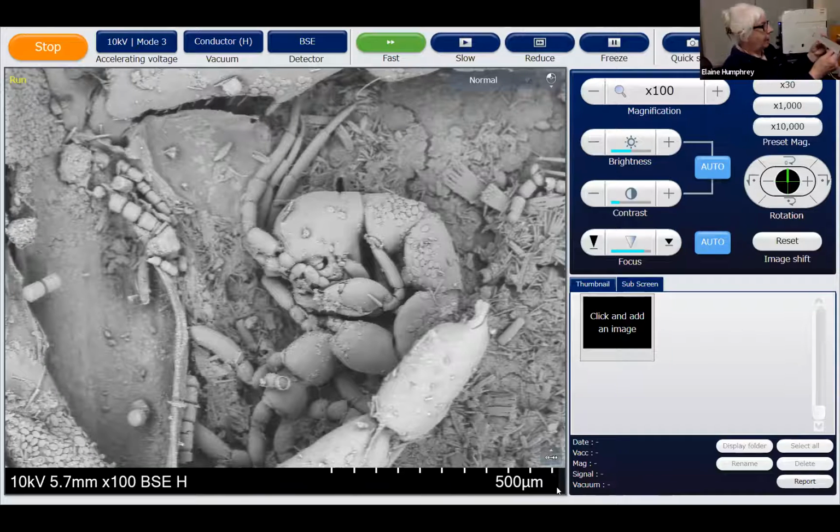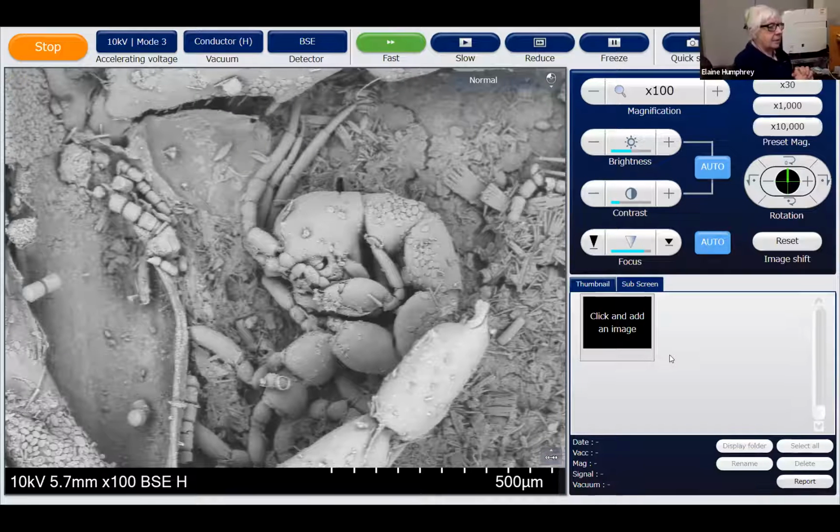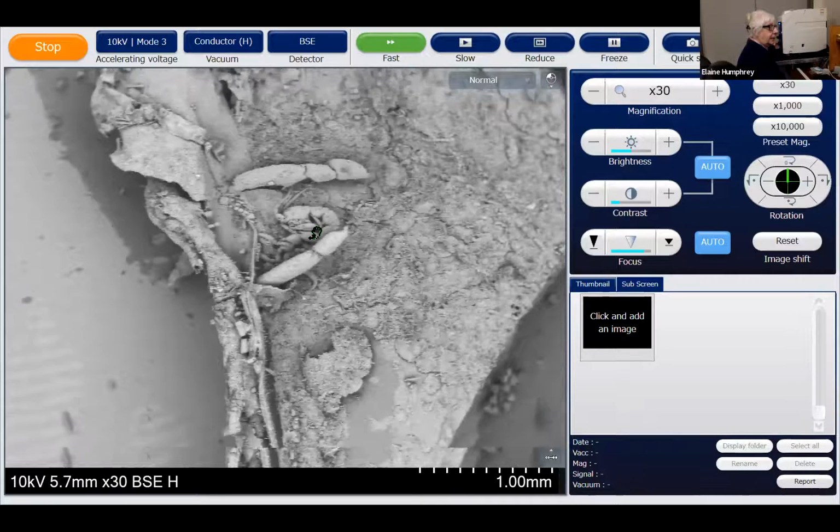On a ruler. Yeah. So this guy is about 500 micrometers across. So if we have a resolution of 100 to 200 micrometers, and that usually depends on how old you are, until you get glasses. And then once you get glasses, you get your resolution back. It's all very good. So we'll take him down. And we'll just go over here.